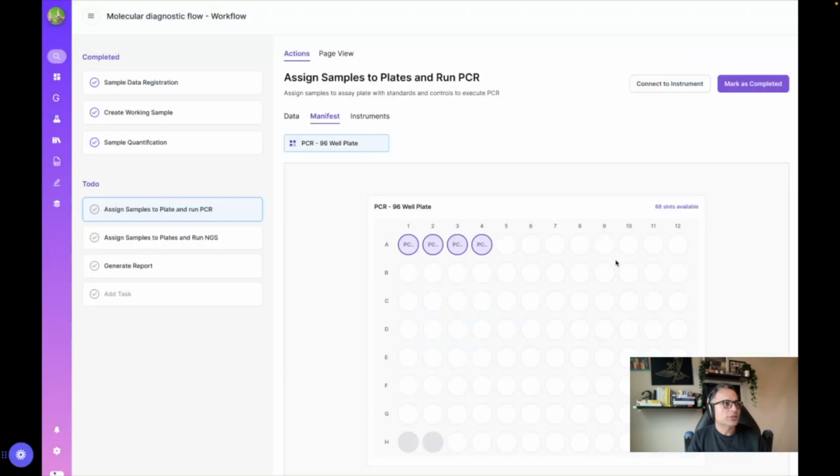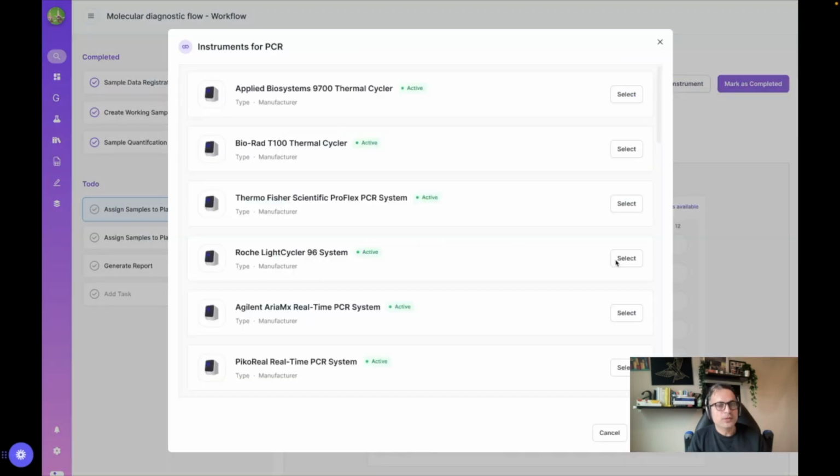Okay, great. Now let's say I'm assigning this to a digital plate, whether that's a 96 or 384 multi-well plate. I can also push the data from the well plate to the instrument. Again, I've seen manual to semi-automated to fully automated. There are some robotic labs that are fully automating this, but I'm seeing more manual and semi-automation here because in some cases labs do post-processing, some sort of transformation they like to do before that data is pushed.